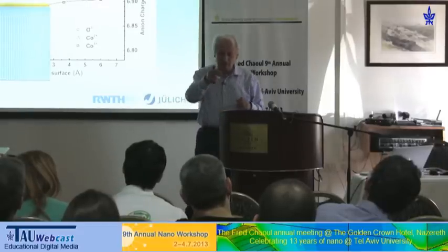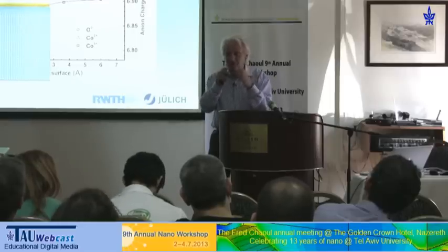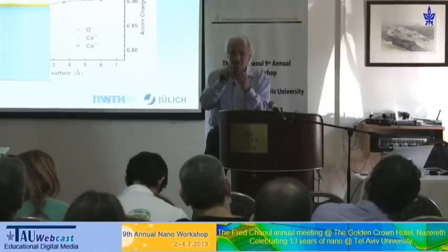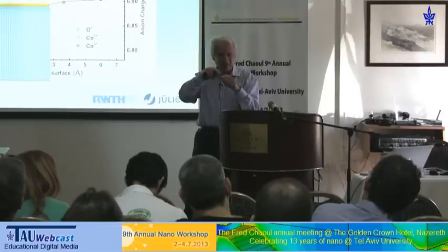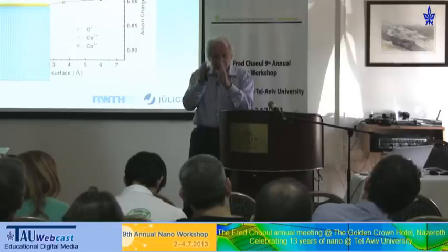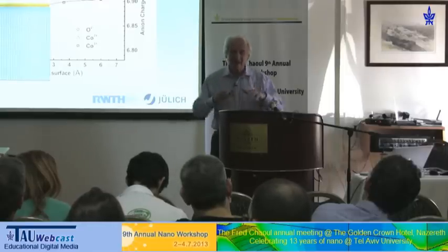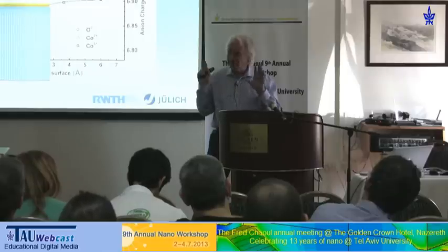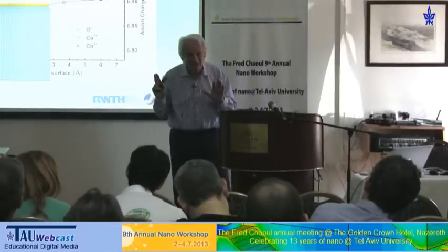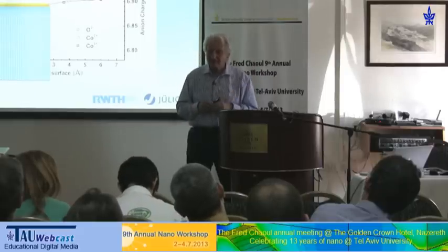And when you are familiar with the field, there is always this intermediate field. In silicon, for instance, you have evidence that there is a tetrahedral coordination. But then you go, say, to the range of 2 tetrahedral diameters, 2 larger diameters. And there you can do scattering experiments where people claim, I have not seen results yet, that they have access to a size range which was not accessible before. So at the moment, everything I'm talking about is crystalline materials. And maybe in a sense it's easier there, but that's the state of this.